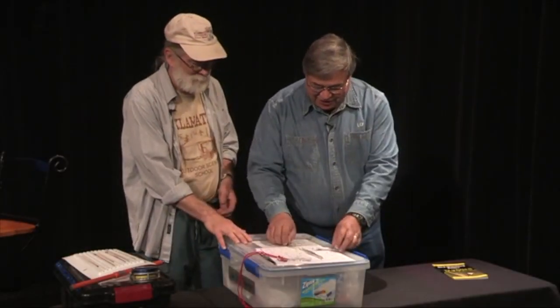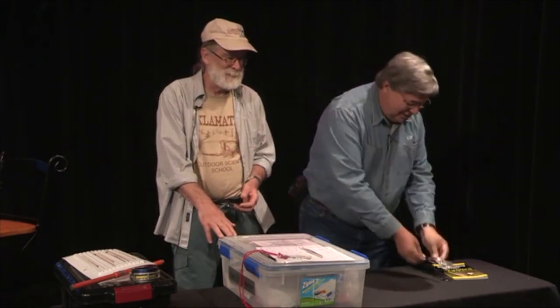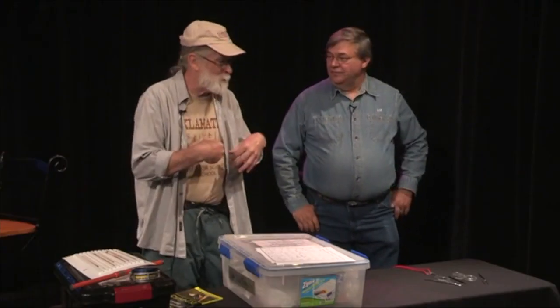This is an owl pellet dissection kit, and here's some of the instruments here. Because they eat everything, swallow it, and they're able to separate the bones and the fur and bring it back up.